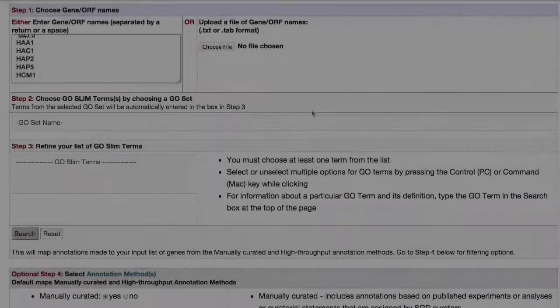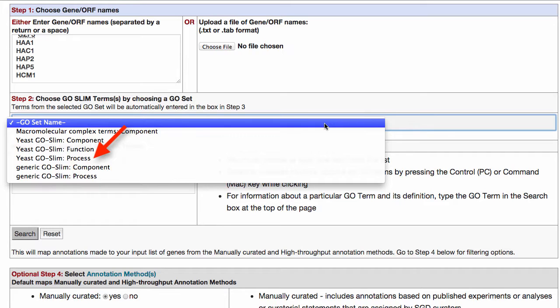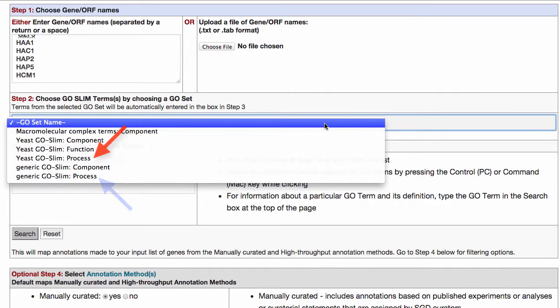Step 2: Choosing your GO Set. These are the terms that you will use to bin or categorize your genes. There are several types of GO Slims, all created for different purposes. Here in Step 2, you can choose, for example, the yeast process terms or the generic process terms. The difference between these is that the generic set is relevant to all organisms, while the yeast set of terms is specific to yeast.